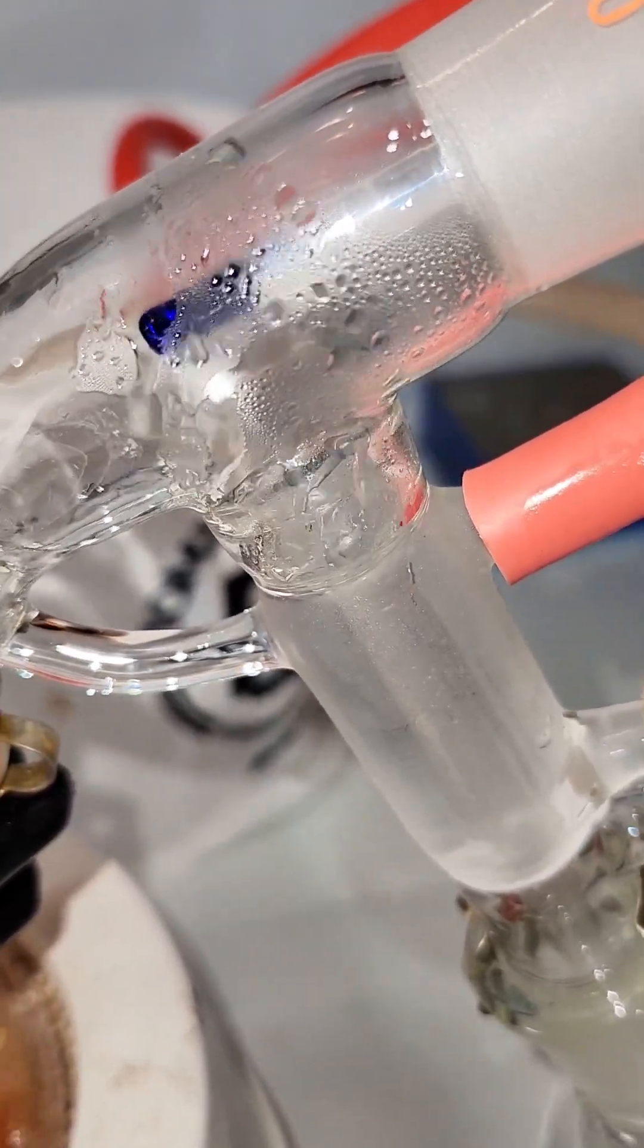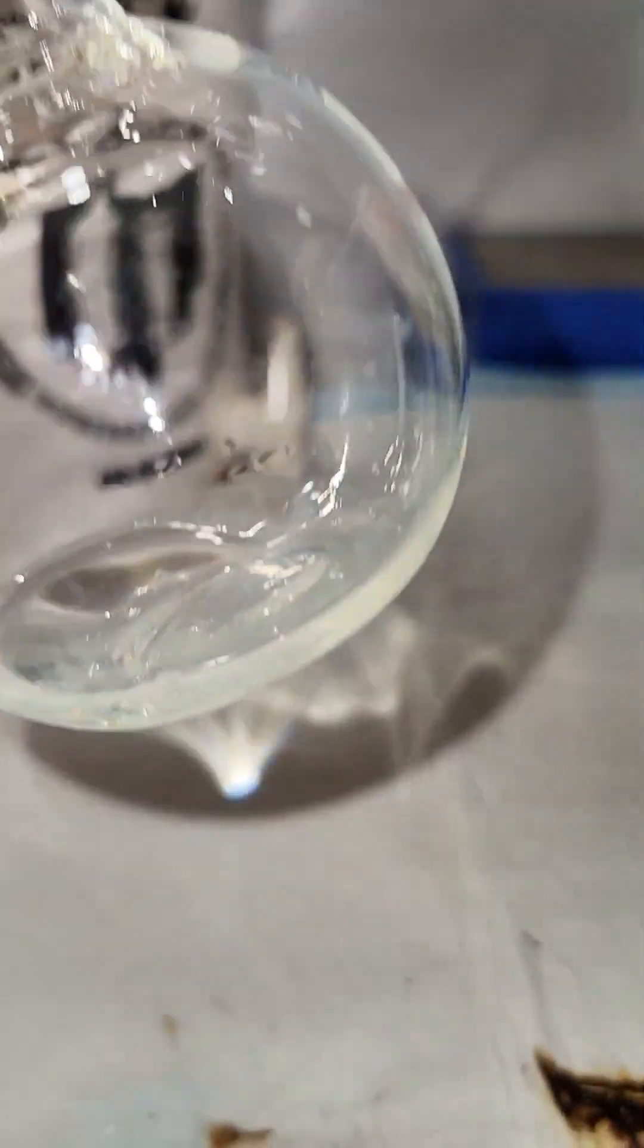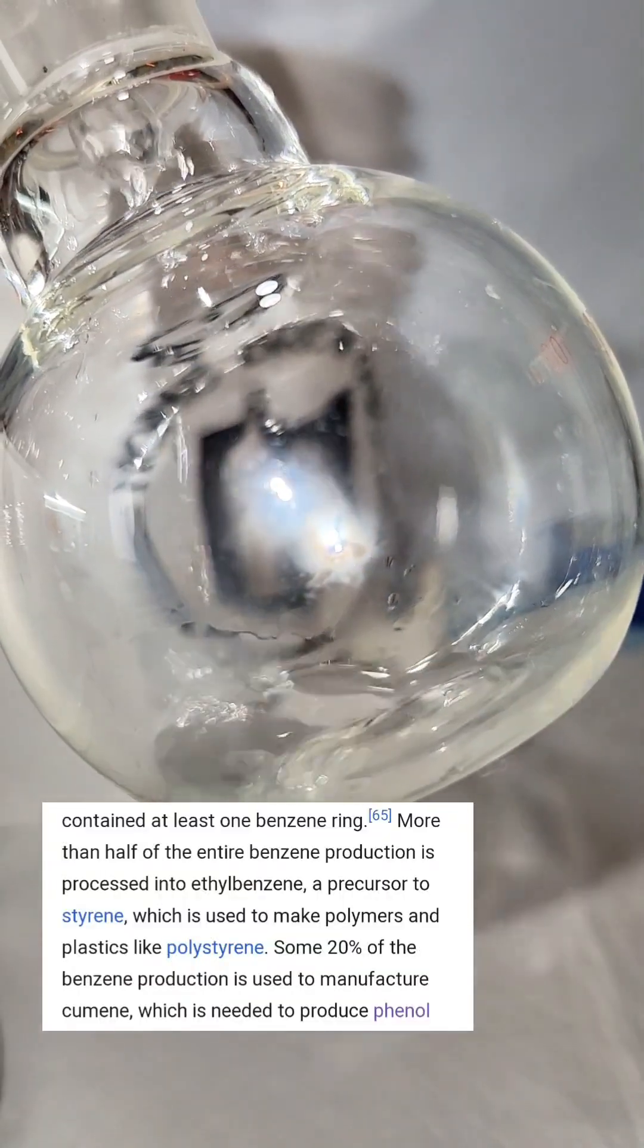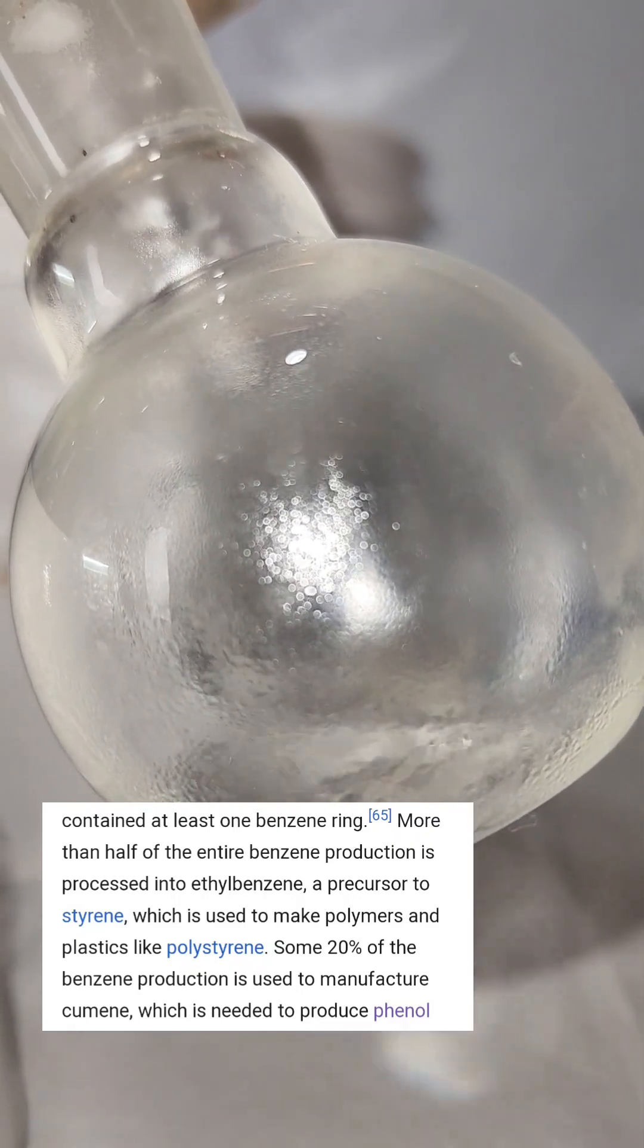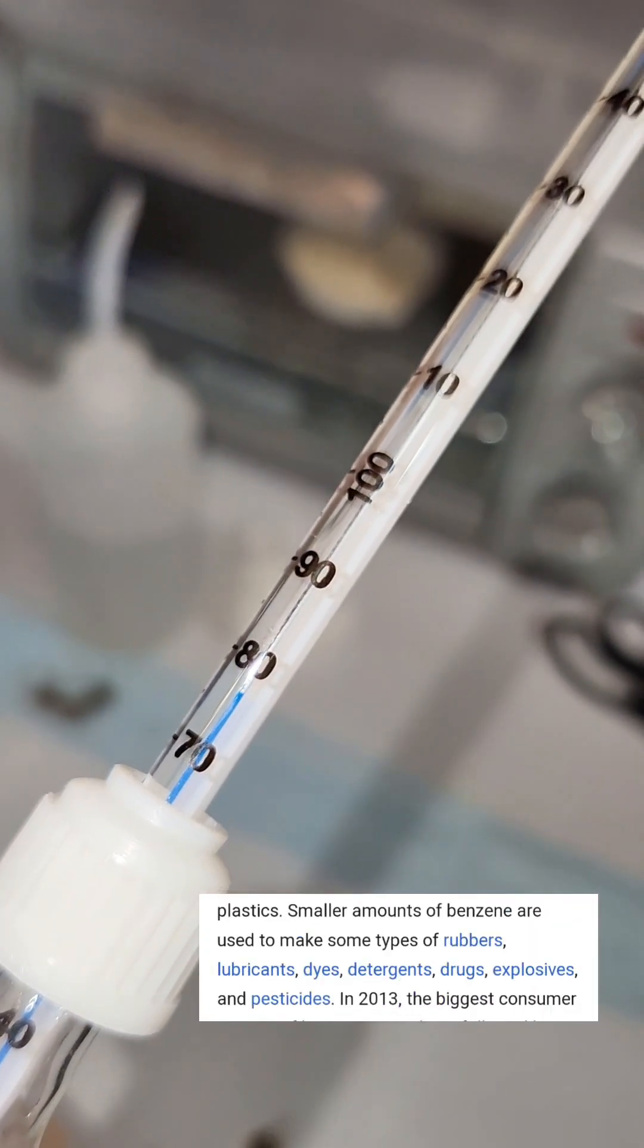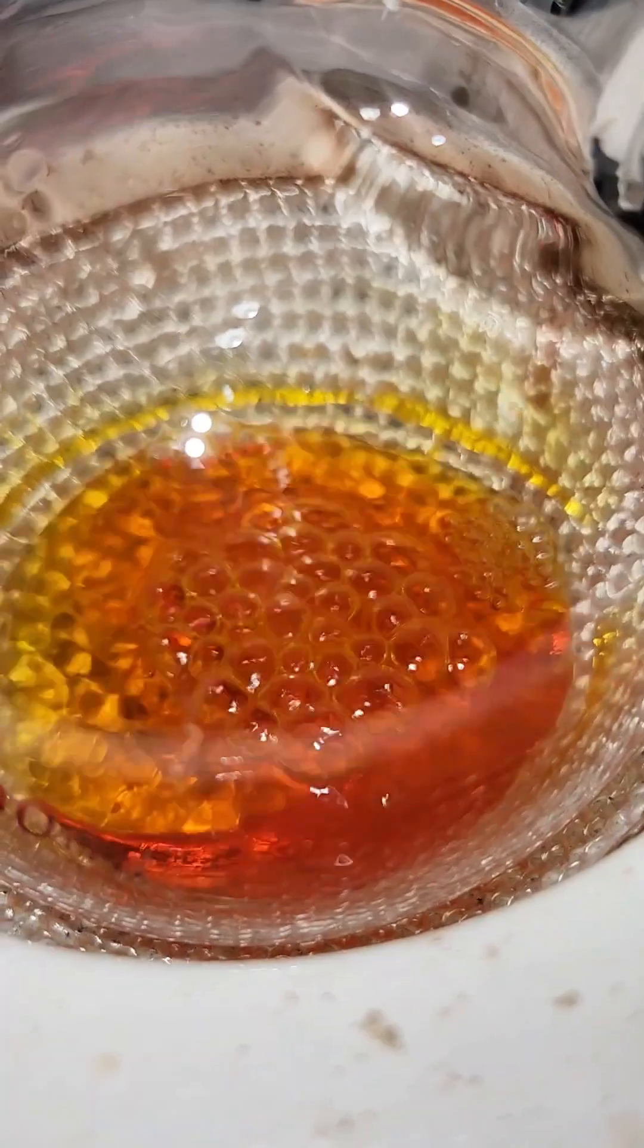I also just realized I never actually said why I was making benzene or what it's used for. To clear that up, most benzene is used to make polystyrene, but it's also a critical organic building block for the synthesis of many different pharmaceuticals, munitions, textiles, dyes, you name it.